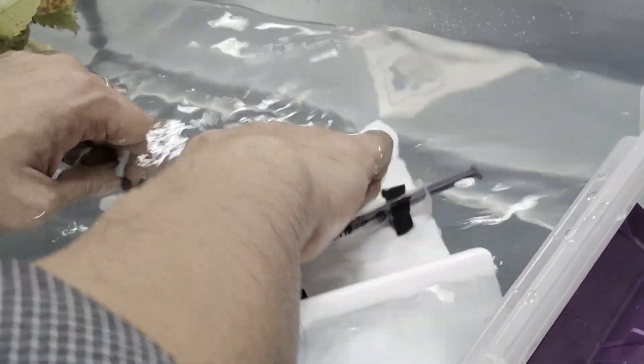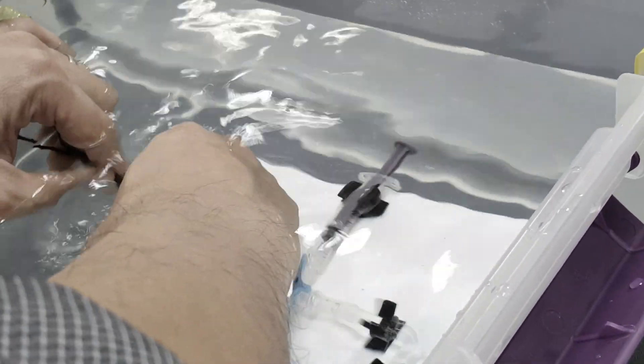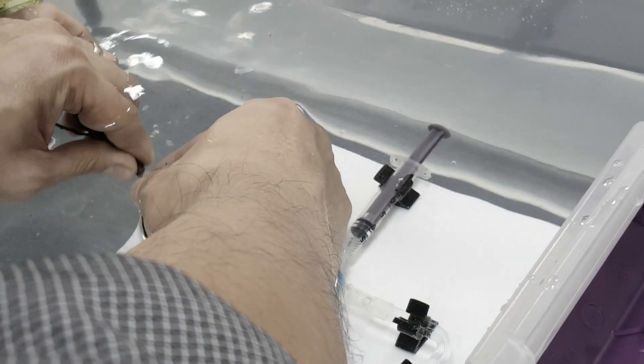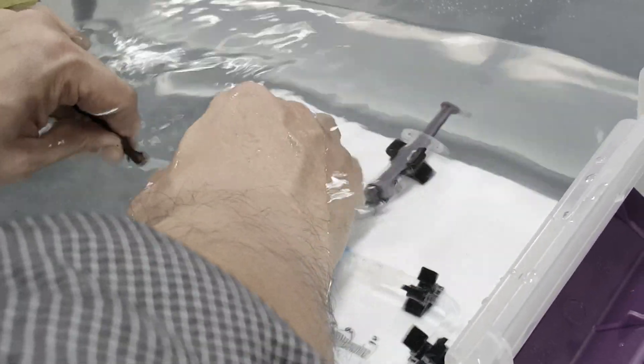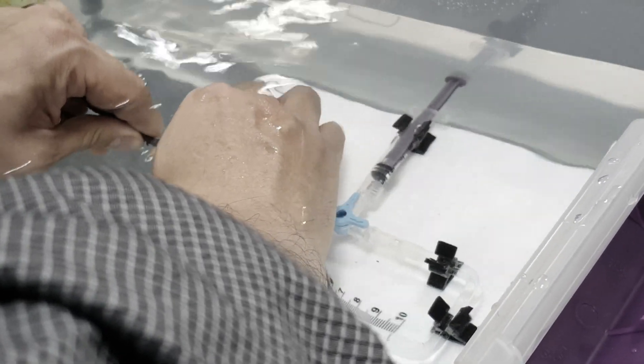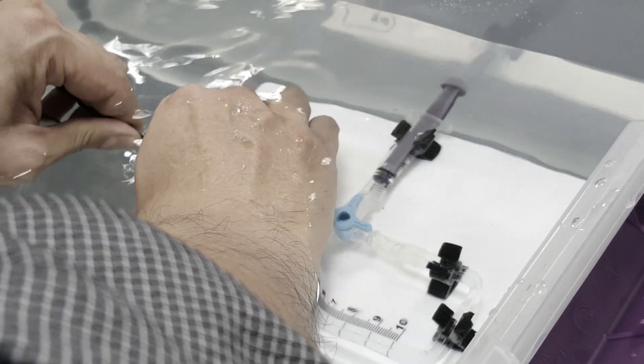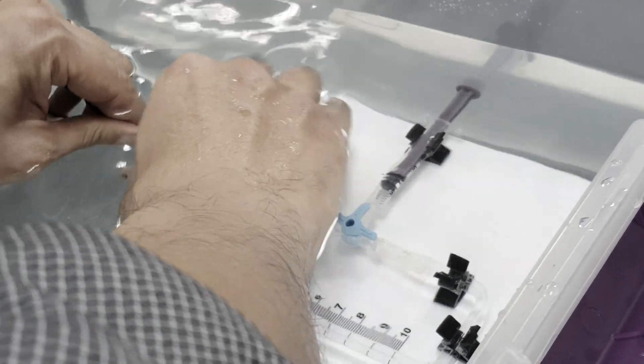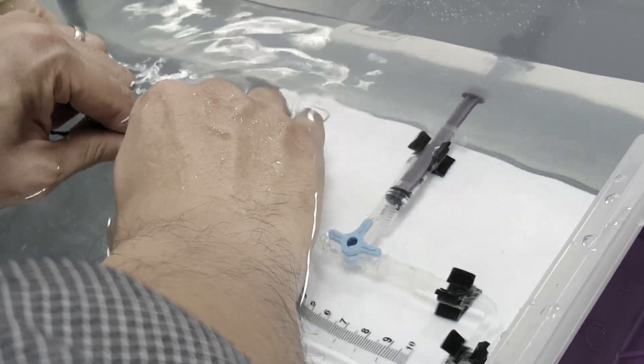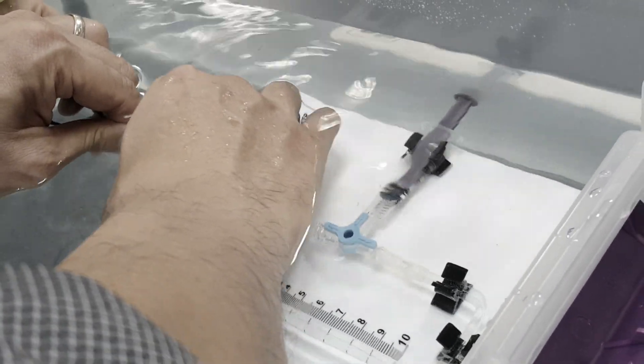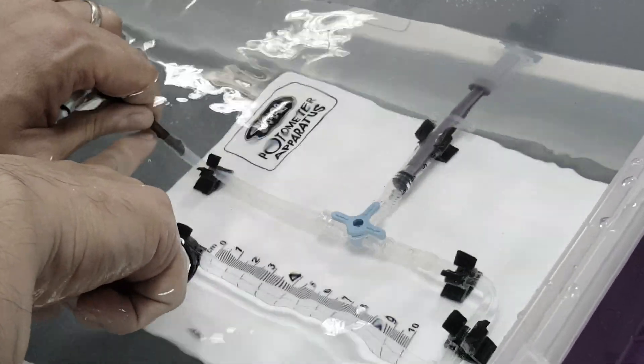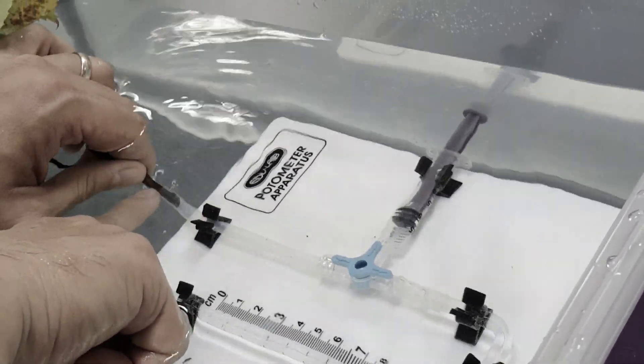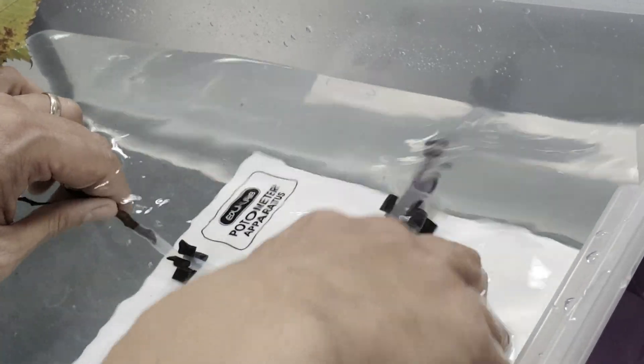You insert the fresh-cut stem into the plastic tubing section of your potometer. Make sure you insert it fairly tight so that there's no leak, there's no gap inside, so it fits in snugly and tightly.